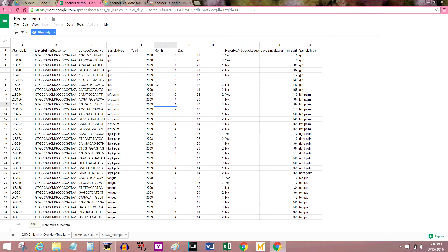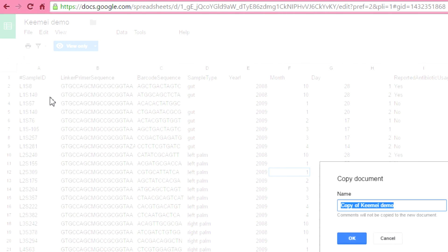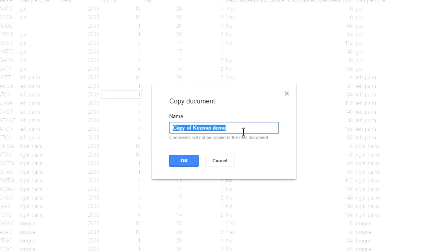If you've got a sharp eye for errors in bioinformatics files, you might notice there are a lot of them here. Don't try and fix them — the point of this software is finding errors, so they have to be there so I can show you how to find them. But we're not going to be using this exact spreadsheet — go to File, Make a Copy. "Copy of Keemei Demo" is a fine name.